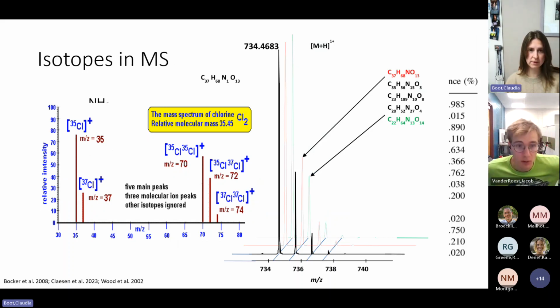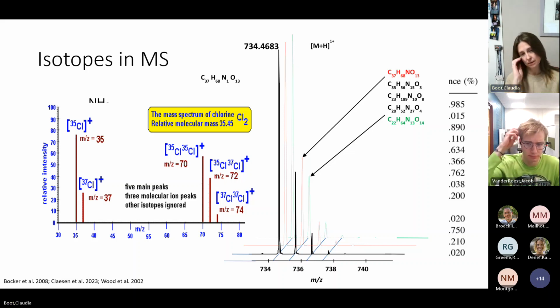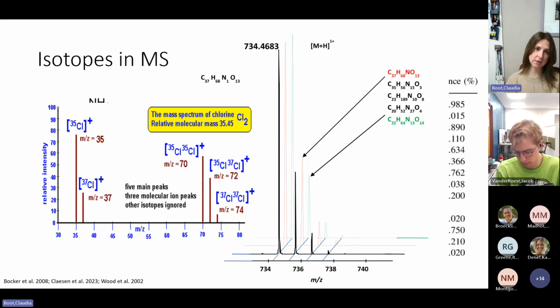I'm showing here two molecules of adenine, one that is just the most abundant version of all the isotopes. So protons, carbon-12, nitrogen-14. And in 1% of your molecules, one of those carbons is going to be a carbon-13. And this is something you can see in a mass spectrometer. You're discretely analyzing these individual molecules as they're moving through that system. And so the natural abundance of carbon-13 shows up in your spectrum. And you can actually use this to help you determine when you've got the correct molecular formula and when your signal makes sense for the analyte you're trying to analyze.